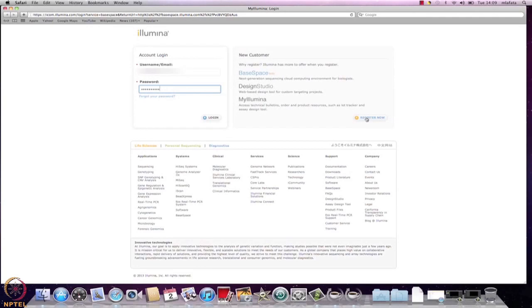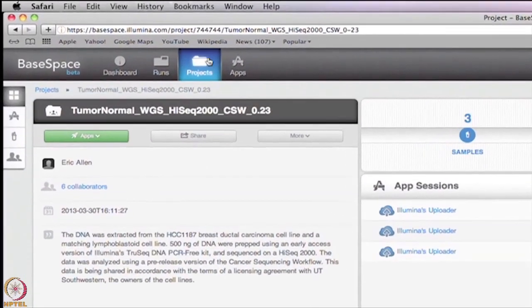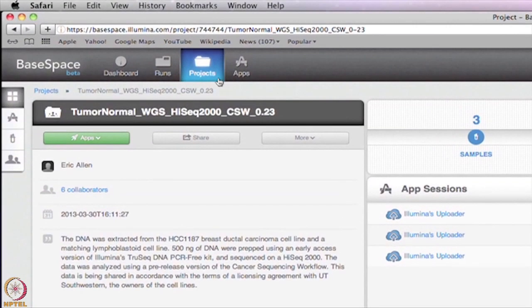Clicking on the link will take you to the BaseSpace login page. Log in or create an account by clicking 'Register Now' — this will give you instant access. The first time you log in to BaseSpace, you may need to read and accept the user agreement. After logging in, you will be taken to the tumor-normal BaseSpace project page. A project is a container for various analysis files, including samples, which are FASTQ files that result from runs, and output files from running analyses, stored under app sessions.